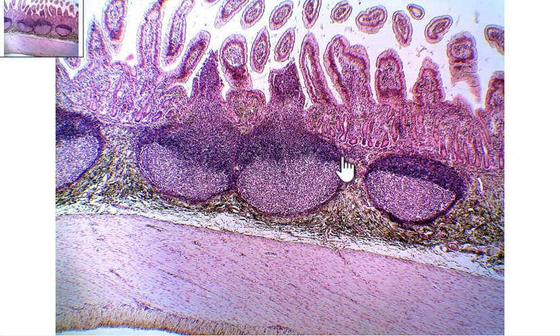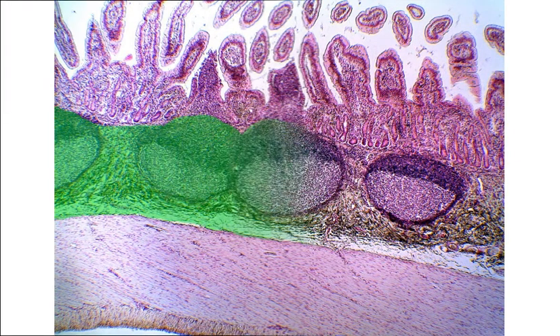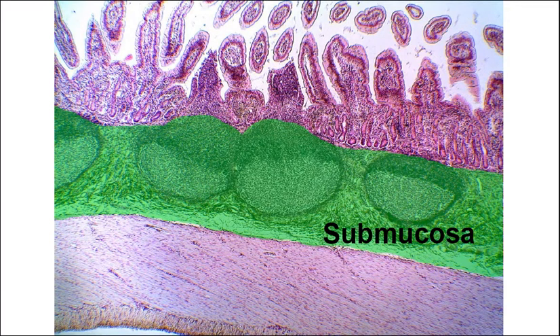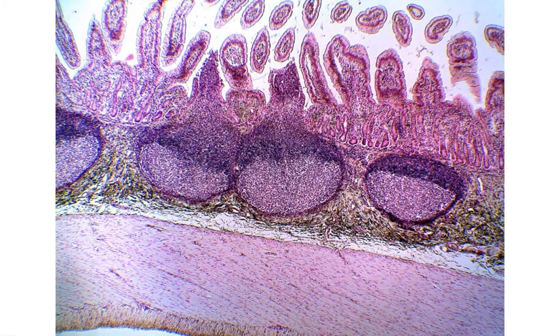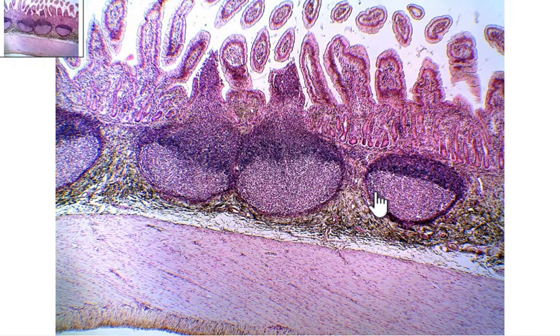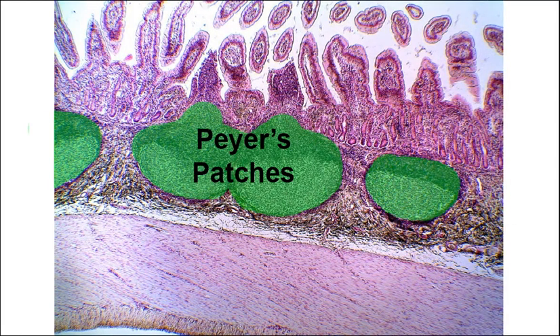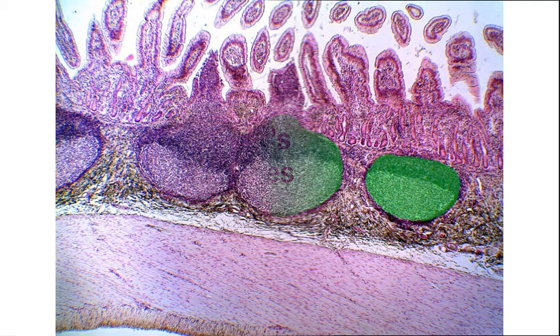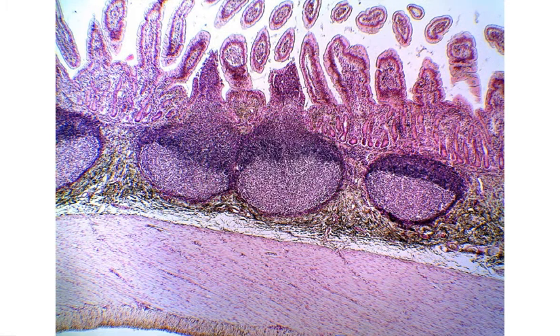Then we come up to this area right here — this is the submucosa. We're going to be able to see a specialized feature in the submucosa: these large circular structures are called Peyer's patches. They help with your immunity and they're only located in the distal portion of the small intestines, hence why they're in the ileum.